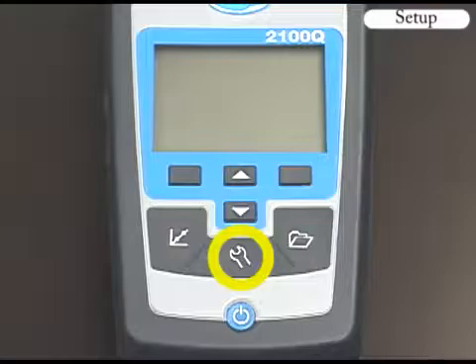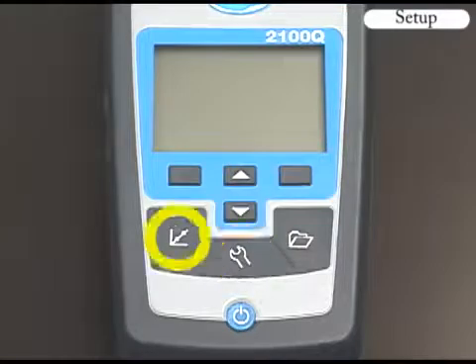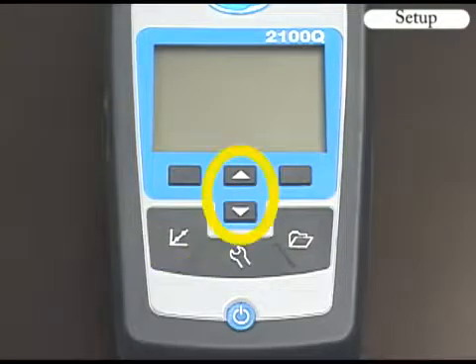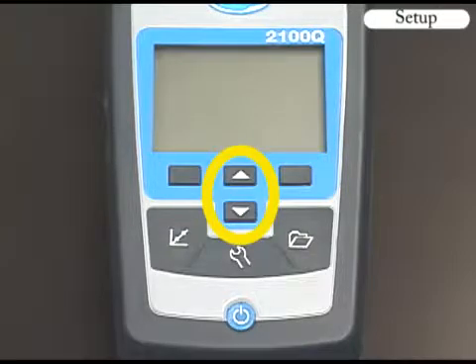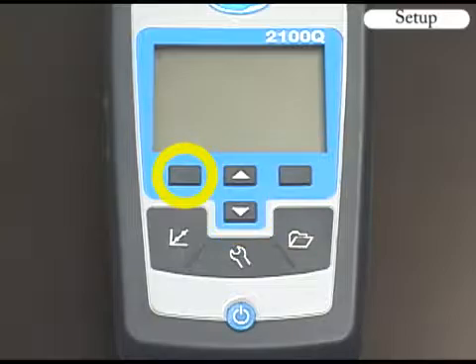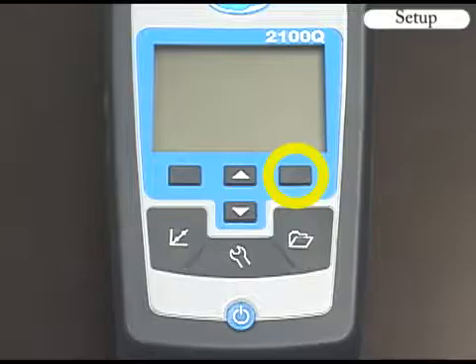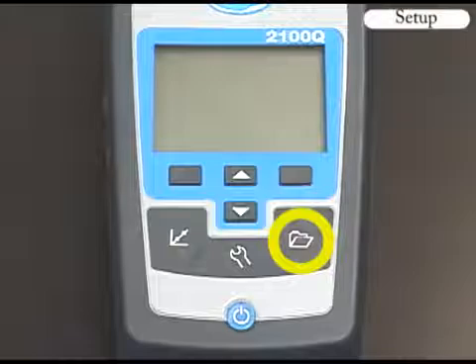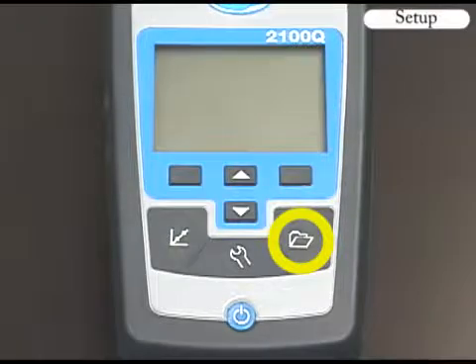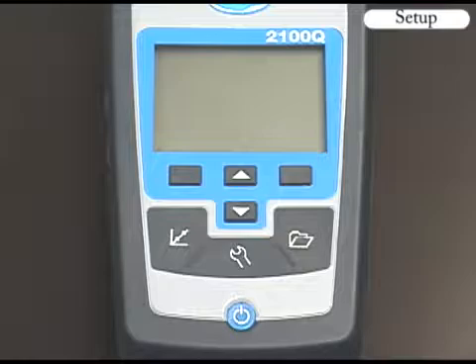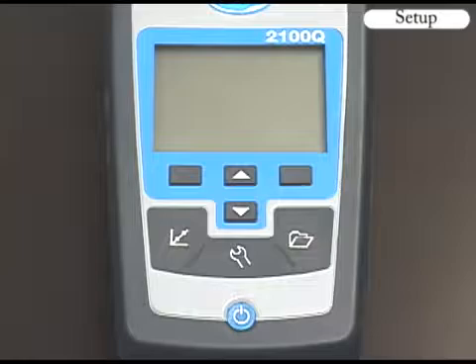This is the settings key used for meter setup. This is the calibration key. The up and down keys are used to scroll through menu selections and enter numbers and letters. The left key is used for calibration verification or to exit to the previous screen. The right key is used to read the sample, select options, and open submenus. The data management key is used to view, delete, or transfer data. The 2100Q is capable of storing 500 readings, 250 verifications, and 25 calibrations.